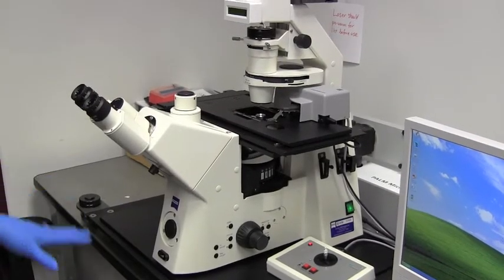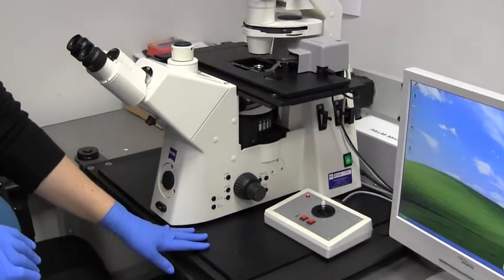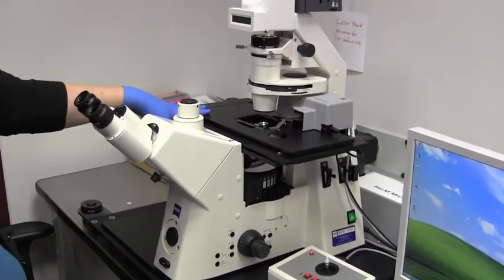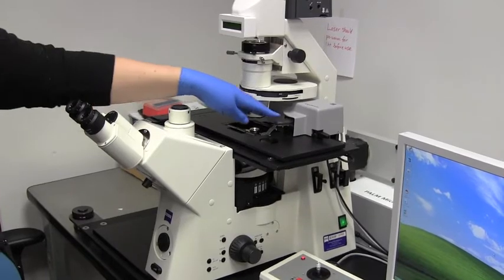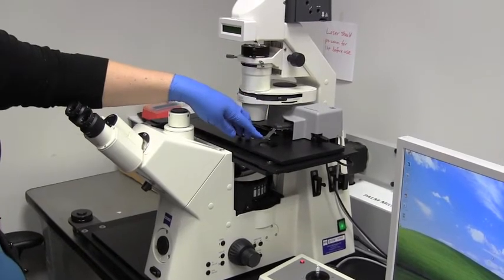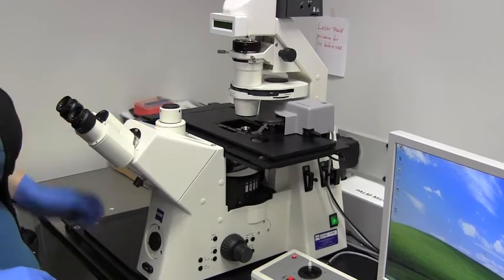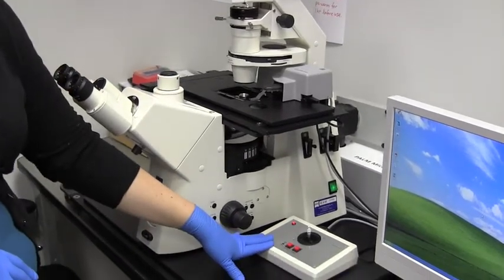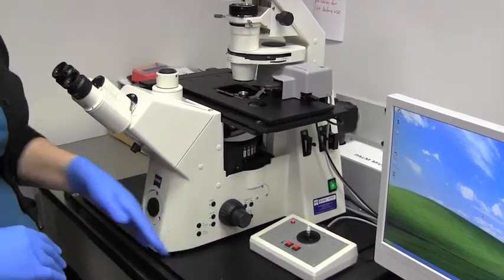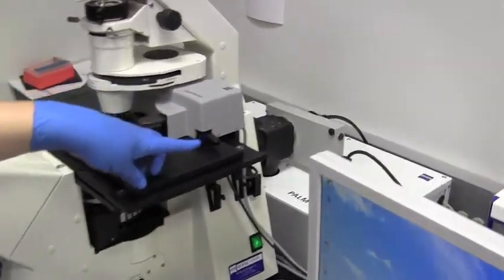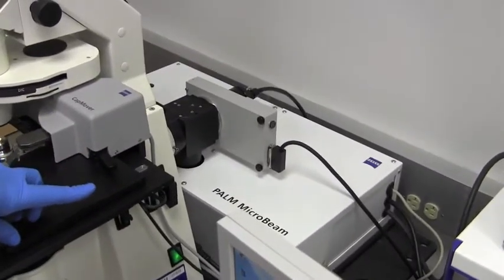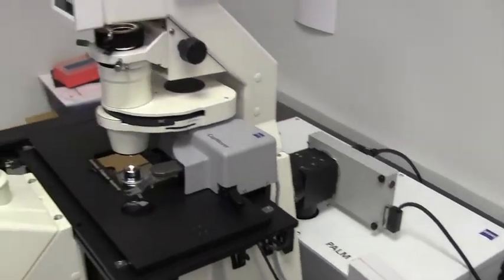Now the microscope itself rests on an air table for stability. It's equipped with a mechanical stage that's computer controlled. A cap holder, which is what we put our samples into, which the laser shoots up into. The stage is controlled by this joystick here. And in the back you can see the actual microbeam, which is a UV laser specially attached to this system. And that does the cutting.